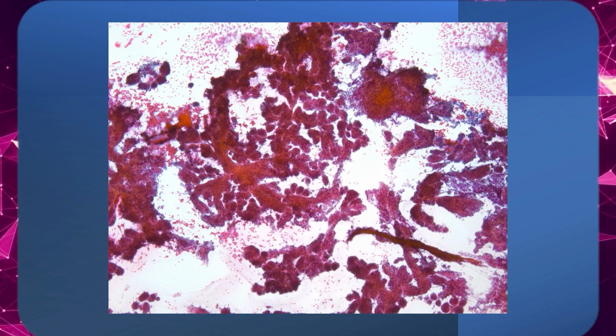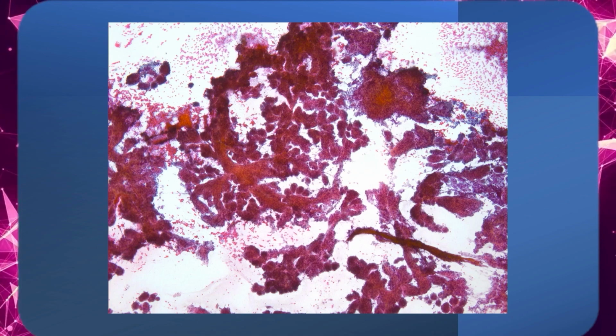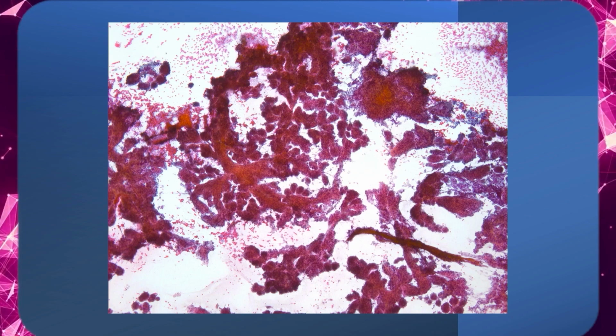It's a beautiful case. You will never forget. And the importance of doing these unknown cases, Dr. Rozaya always used to say, you read it in the textbooks, you will forget. But when you are quizzed in an unknown case session, you will never forget. So you'll always remember someone in Lahore at an IEC tutorial showed us a metastatic GBM, which was donor acquired. You will never forget. So this case you will never forget.